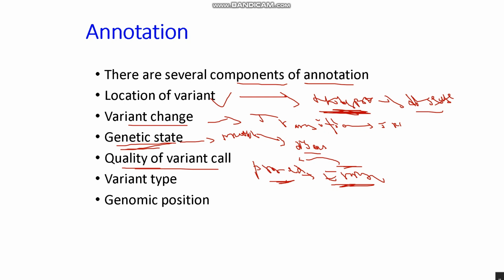Sorry, Ali, can you explain the Phred score again? Actually, the Phred score is given to every nucleotide present in the sequence.